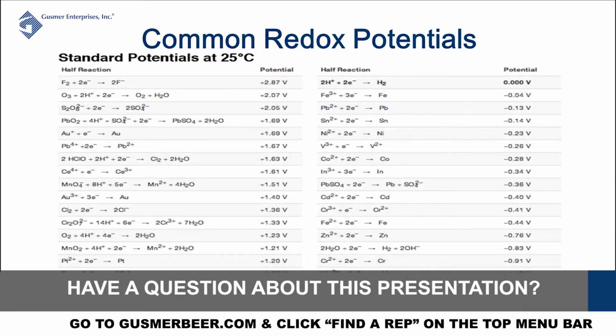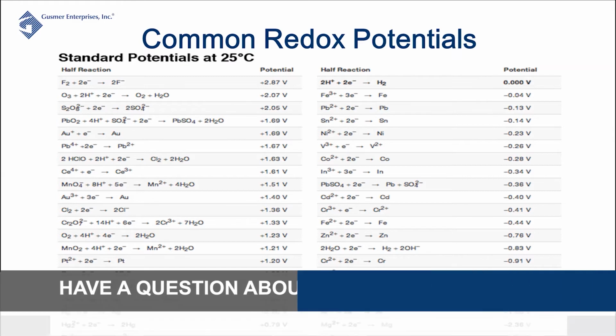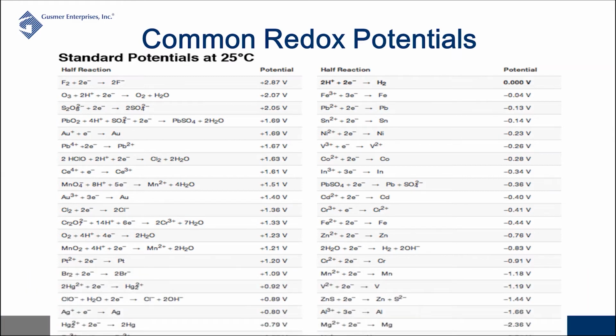So as we move electrons around from substance to substance, that potential can be measured. Now the point here isn't to focus on all the individual chemistries that are going on, but to show that these half reactions generate a voltage, and that voltage is either a positive or negative number. Positive voltages refer to more oxidizing reactions or oxidizing chemicals, whereas those negative voltages are based on those compounds that tend to donate those electrons a little bit more. And so we can look at voltage or millivoltage from these potentials as a way to monitor what's going on in certain systems using ORP measurement. Next slide.